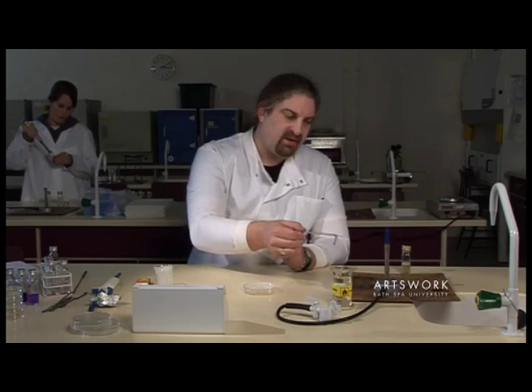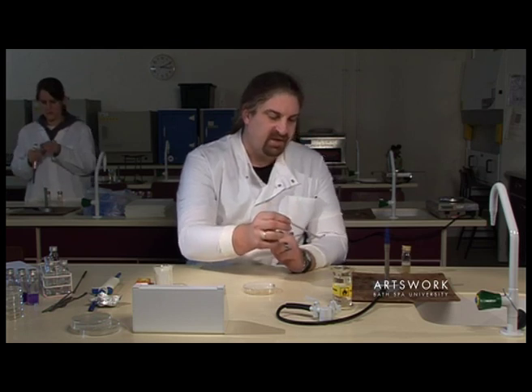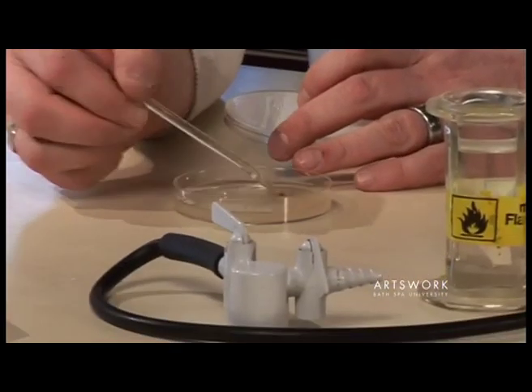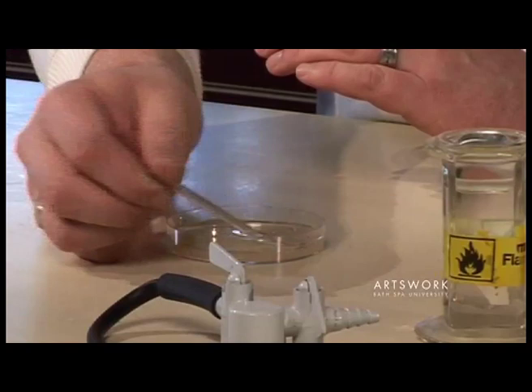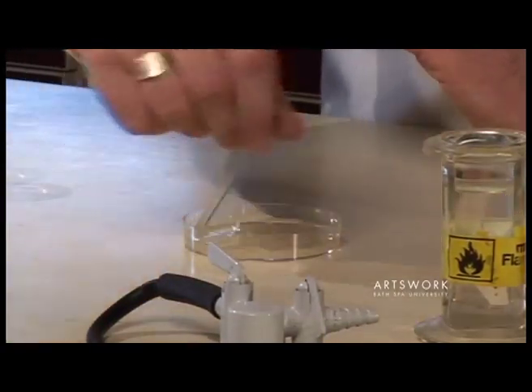The alcohol will burn off and that will sterilise the surface of the tool. Give it about 5 to 10 seconds, and then using the tool just gradually spread your culture out so it covers the surface of the agar. Try and get a nice even spread right the way across the surface.